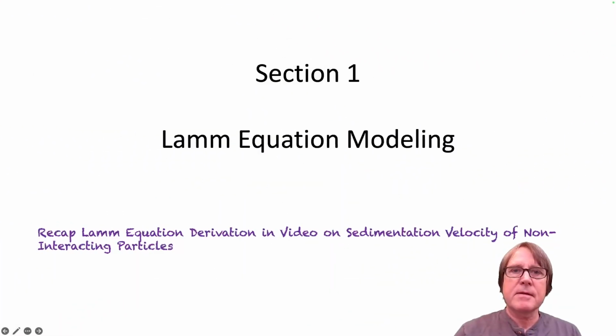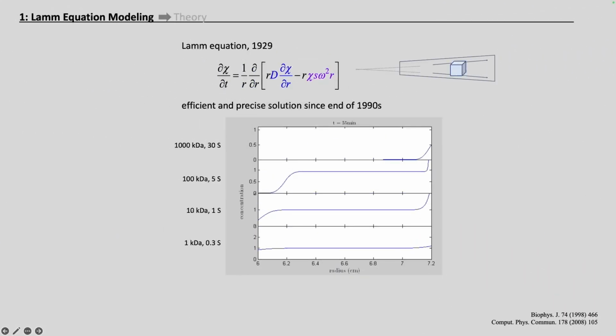So perhaps the most straightforward approach from a theoretical perspective would be to use Lamm equations to describe the sedimentation process of the individual species and their complexes that are formed. In fact, at least that was the big hope during most of the 20th century, when solving the Lamm equation numerically or with analytical approximations was not yet feasible efficiently enough for practical data analysis. And so this approach remained theoretical and still seemed very appealing.